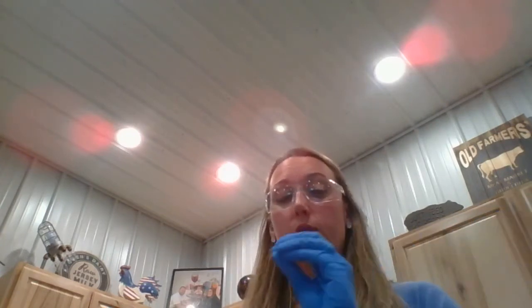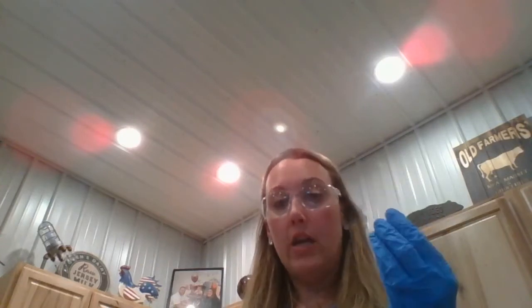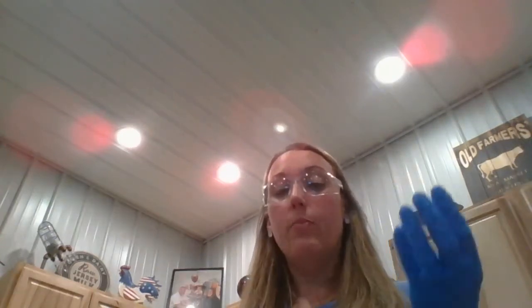From there, it moves to the gizzard. The gizzard is kind of cool. I'll show you the gizzard. It looks like a white pea. It's very hard on the outside, and there are sand granules on the inside of it to help churn up the food, like what your stomach would do. The gizzard acts as the stomach. Once the food is in the gizzard, it then travels to the intestine.